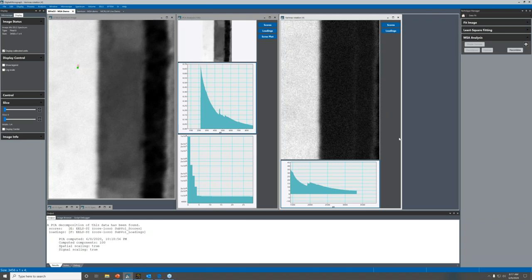That was an example of a sample that's pretty easy to work with. This is counted data from a K3 EELS system, so we have a very well-behaved detector with ideal noise. We also have a well-behaved sample — a fairly thin FIB section with no big changes in thickness, so the plural scattering contributions are fairly uniform. The combination of a good sample and a very good detector gives us this benefit in the analysis.